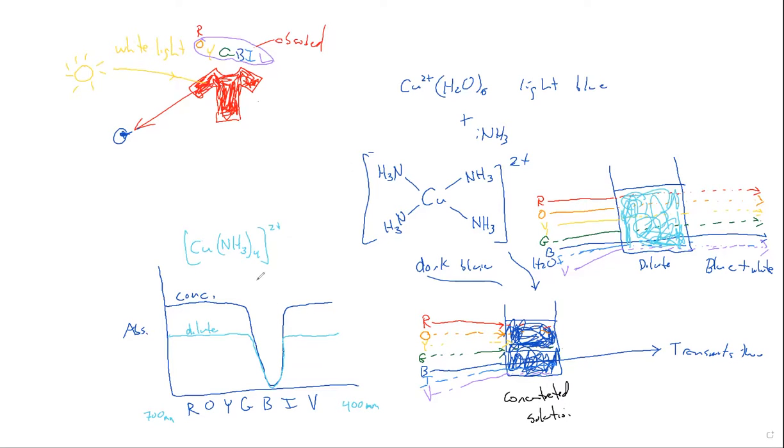Should we shine the blue light through the sample, like in this range, or should we shine in the range over here, like orange or yellow light through the sample? Where can we see a differentiation of the absorptions?